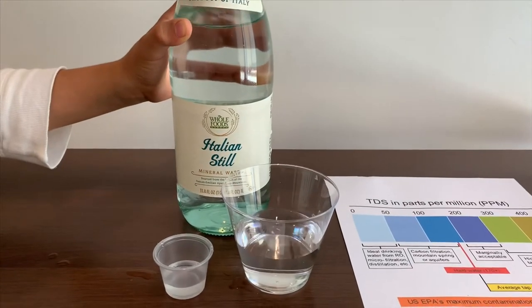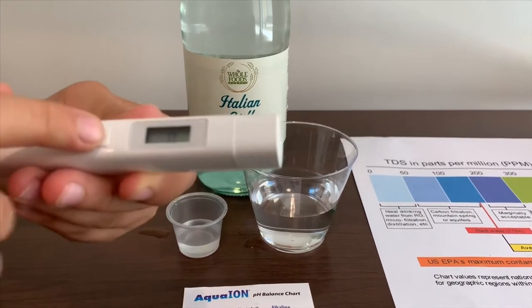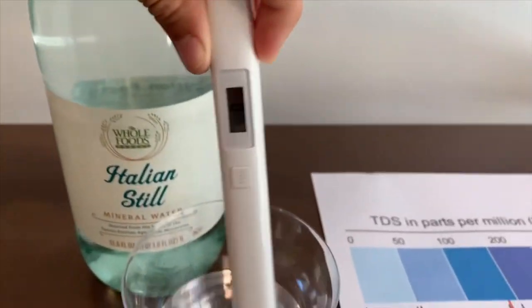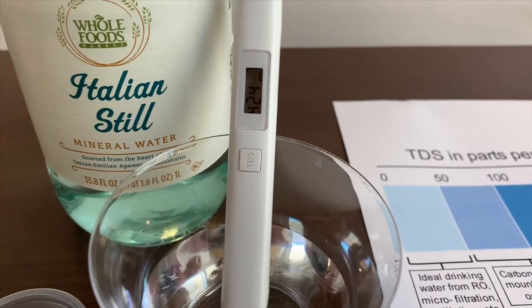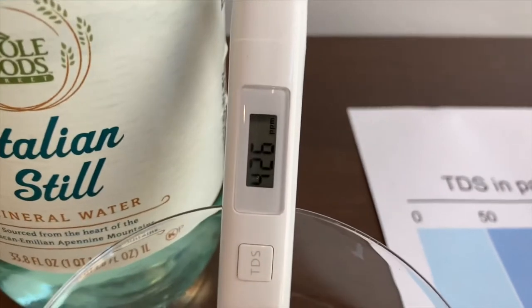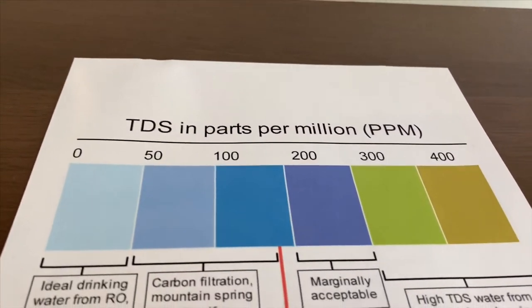First, we're going to test the TDS. Turn on the TDS tester. Make sure it says 0 and put it in. It says 424. That is high TDS water.